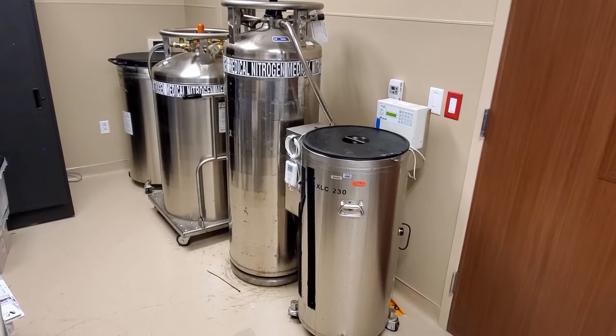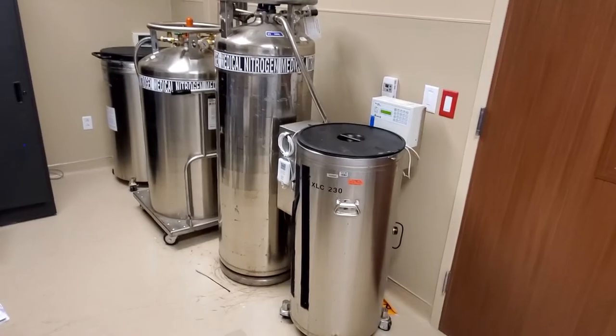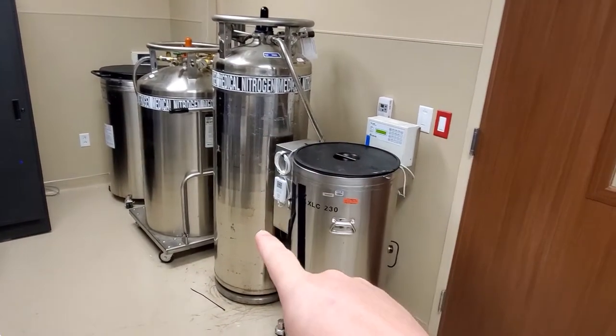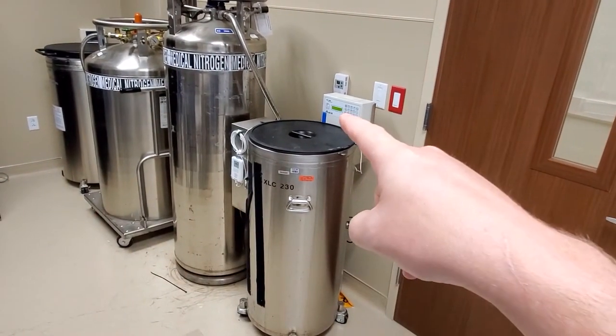Hey everyone, I want to take this time to introduce you guys to Liquid Nitrogen Ultra Low Freezers. As you can see here, we have Liquid Nitrogen Tanks. This would be the freezer, as well as that one back there. And these are the controllers.